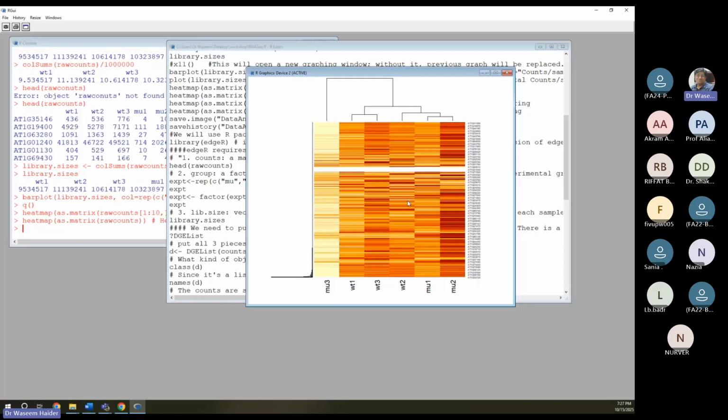Then those things are preserved, so your gene expression RNA is preserved. Otherwise, it changes real quick, in fractions of, maybe, nanoseconds. So while you're sampling, you need to stop that gene expression at some point. Nazia, do you have a comment?